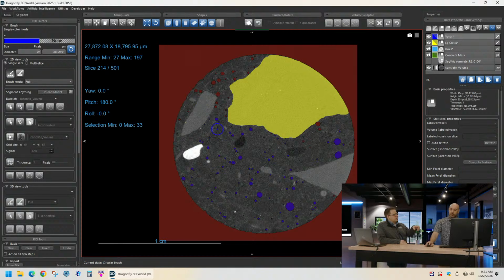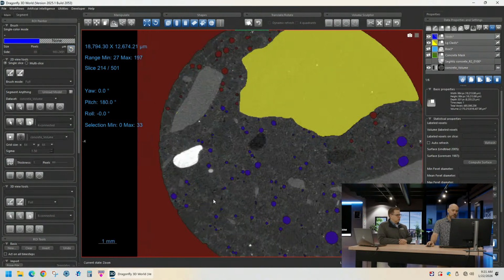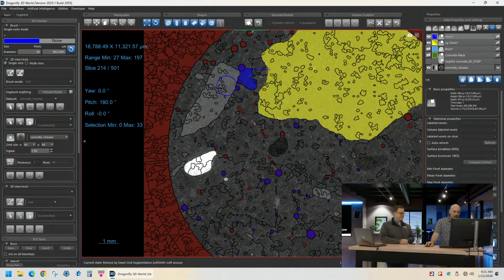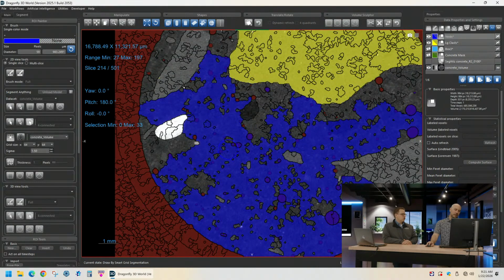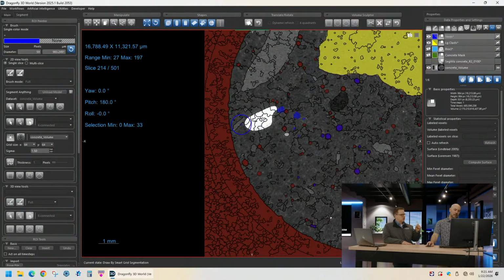So now you can. Could you combine that also with the grid tool? Because I noticed that some of the edges there, they don't look so perfect. Yeah, so now we can apply the grid and then Control. Uh-oh. Whoa! That's my mistake. I thought that would have. Oh, hang on. Oh, no. Sorry, that's my mistake. Okay. Yeah, so you have the grid on. So then you could go back, and you could touch up those little bits. You've got to make sure that the cursor is tiny.